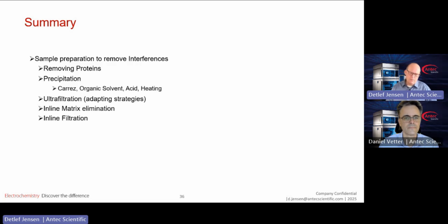We talked about removing proteins. We talked about the different precipitation approaches. We talked about ultrafiltration. We talked about inline matrix elimination. We talked about SPE. We talked about inline filtration, and we talked about the good of using existing sample preparation techniques published by colleagues, because it saves time and money and allows you to generate comparable data. There was a lot of information, I'm aware of that, but I hope it was interesting.